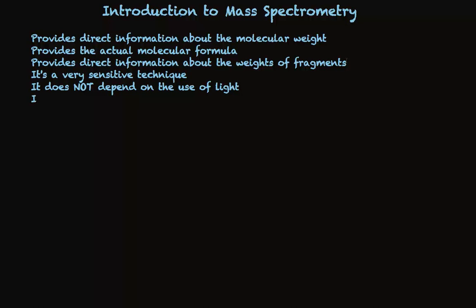It is destructive. The sample that's actually looked at is consumed. And importantly, for some applications, it's worth noting that the actual examination by the instrument is done one molecule at a time, or more specifically, one ion at a time.